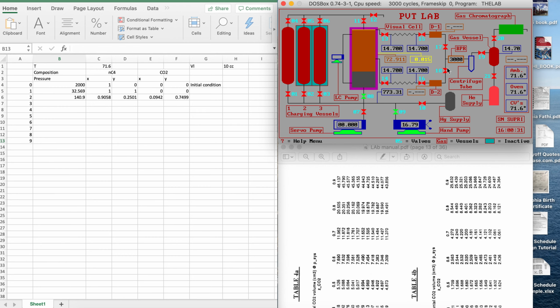So this time I'm gonna do 0.008. So I want to be very close to that number, and I'm going to shake it. Okay, so we are getting close. So I'm gonna do 0.003 this time.